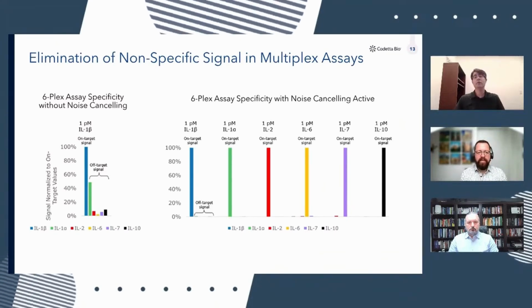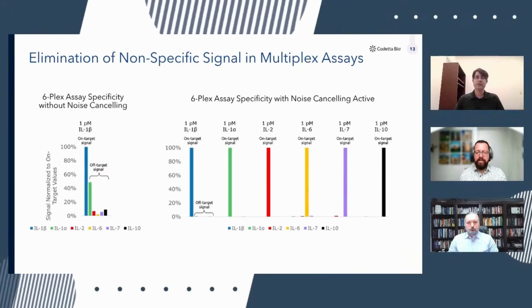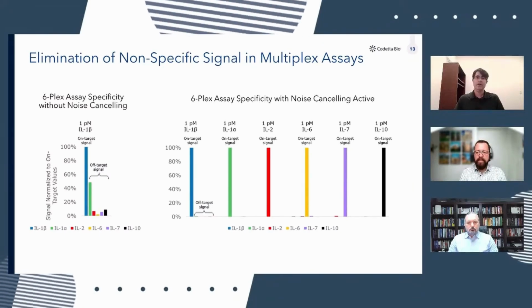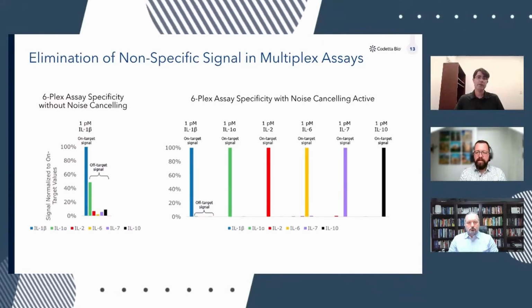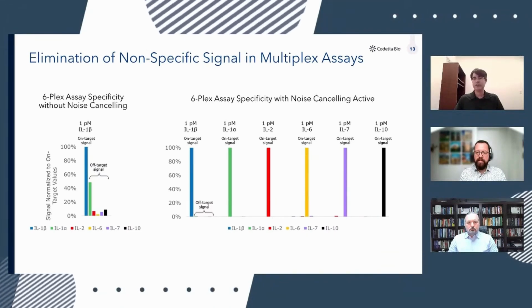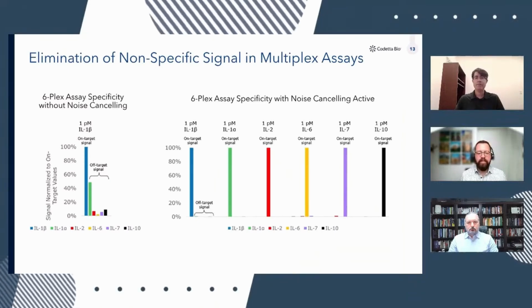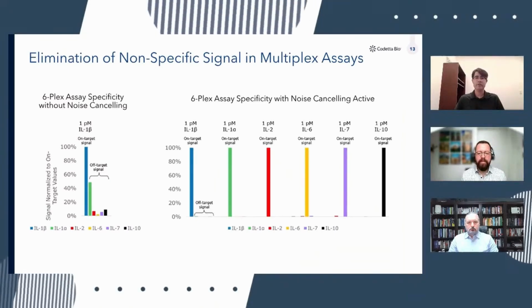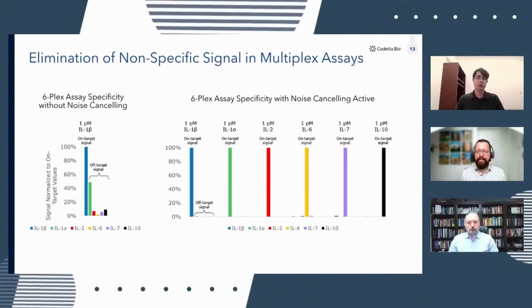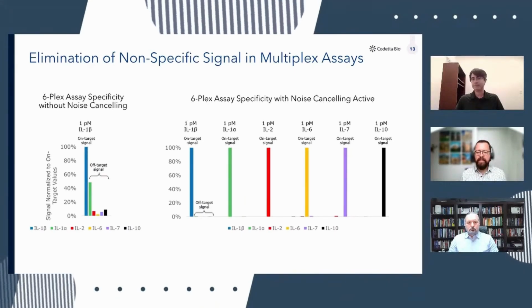In the graphs on the right, we show the same reaction conditions, but in this case, the noise canceling approach was used to amplify the PCR signal. So in the case of the same experiment with a single target IL-1 beta added to the 6-plex assay, again, we see a nice strong signal where we expect to from IL-1 beta, but all of the off-target signal has been eliminated or suppressed, which we can then show holds true for the other 5 targets when they're added one target at a time.